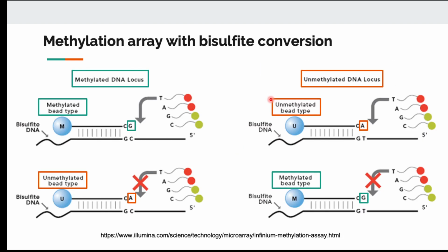And similarly, you can couple this with other molecular assays, like bisulfite conversion. So if you design your probe all the way up to the CG island, and you do a bisulfite conversion that detects between modified or unmodified cytosine, you can do a polymerization reaction and see if you can incorporate a G or an A onto that location. And then you can compare with the bisulfite and without the bisulfite. So you can identify DNA methylation. So these are the same things that you learn from sequencing lectures, but adapted to be made on microarray.